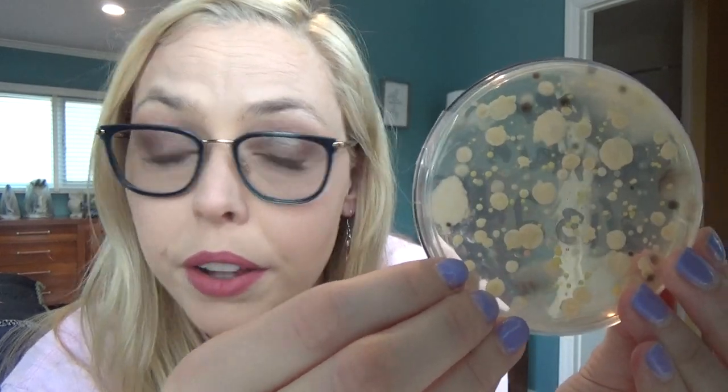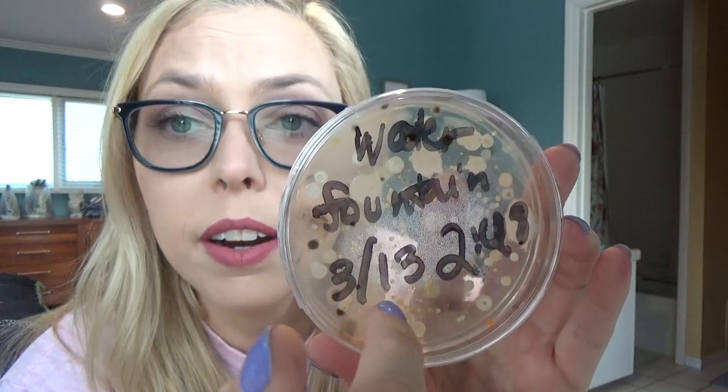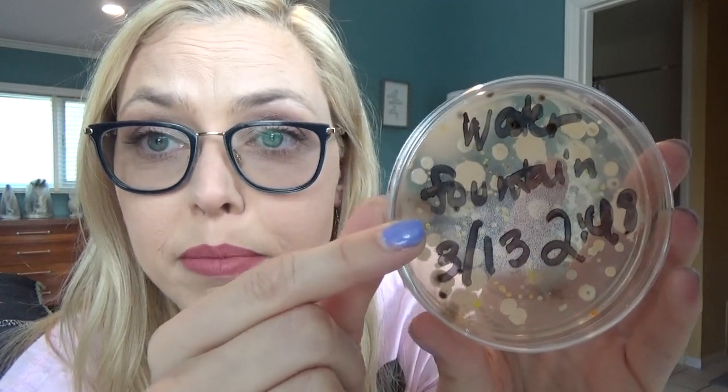Let's look at the water fountain, and then we're going to look at my hands before and after sanitizer. The water fountain, just like the bottom of that shoe, grew pretty quickly — not as quickly as the shoe bottom — and has a lot of little tiny colonies. On this side you can see a lot of orange and a lot of yellow. There was a lot on the water fountain. Good idea, sixth period, because I wouldn't have thought about that.